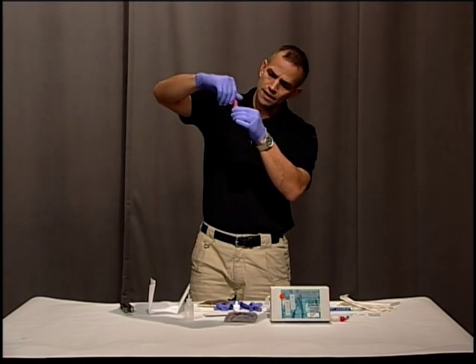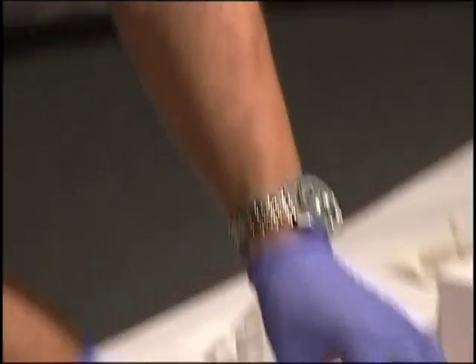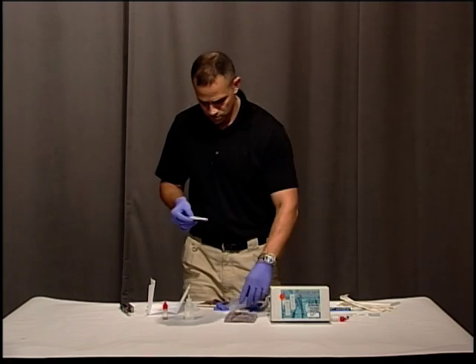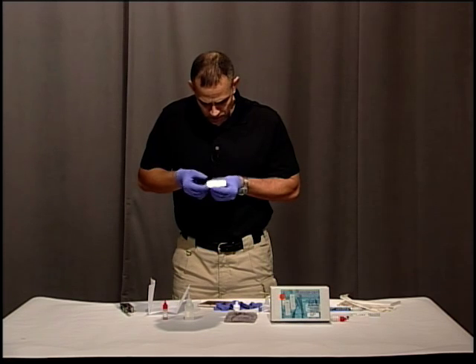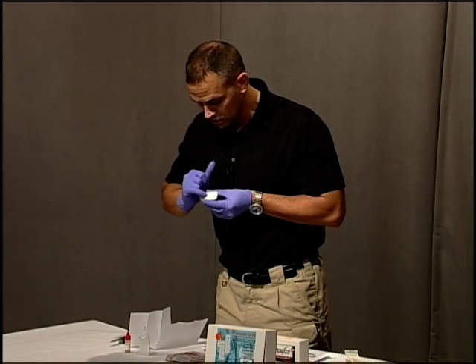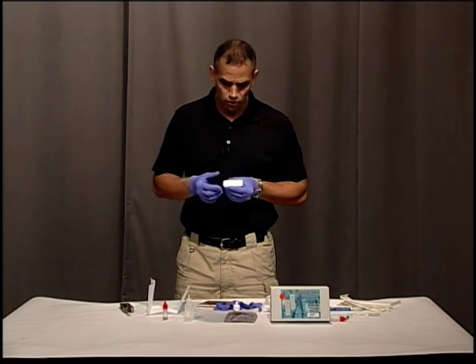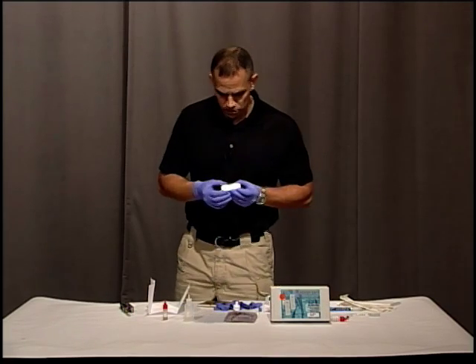I'm going to screw this back on, shake that up, and while I let that sit for a second, I'll open up my test. The test shows a sample area where we put our sample, and then two lines are going to appear — one under C, which is the control showing the test is working, and one under T. If the T line shows, that indicates a presence of human blood — it tests the hemoglobin in the blood.